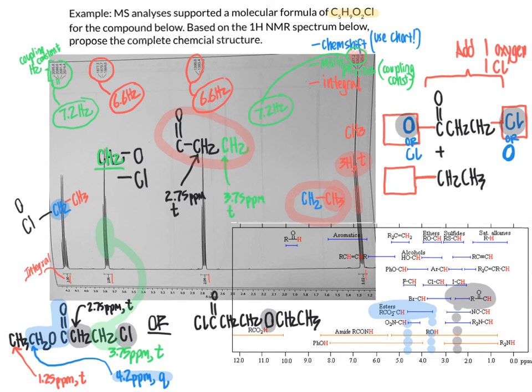Also, if you think back to chemical stability from organic chemistry, the acyl halides are quite unstable and reactive, and so you might wonder if that's the real structure there. If this is a compound that's been laying around for a while, quite possibly that would have decomposed through reaction with water. So that's a practical consideration when thinking about some of these structures. But ultimately, our best match based on the data is going to be this structure in the lower left-hand corner.